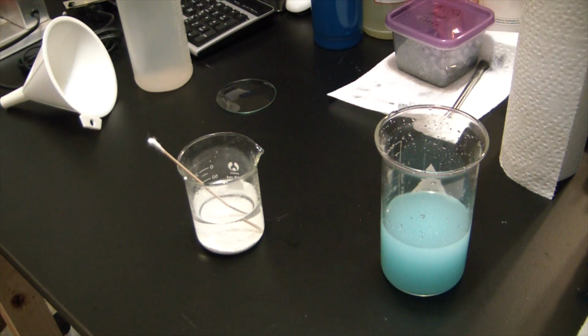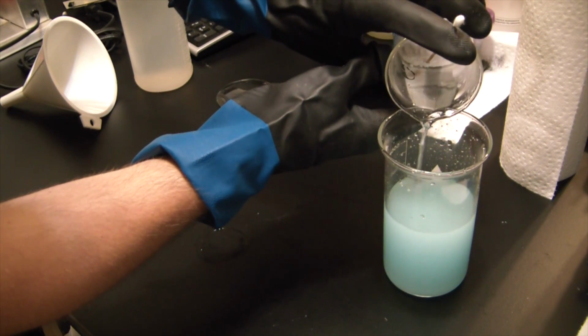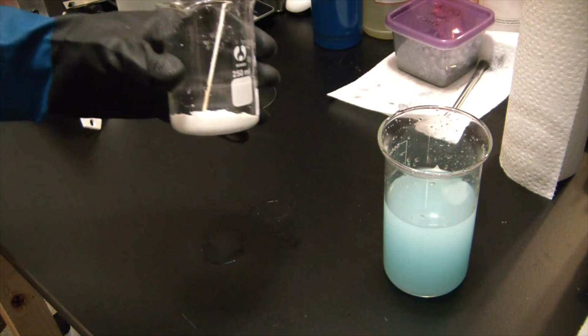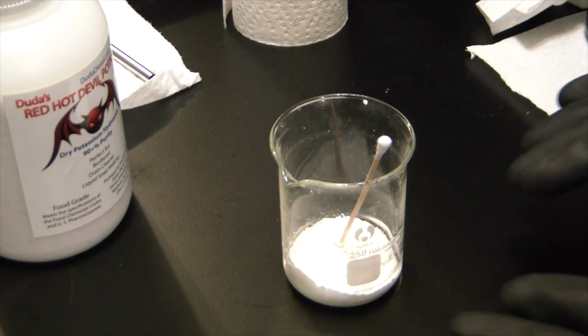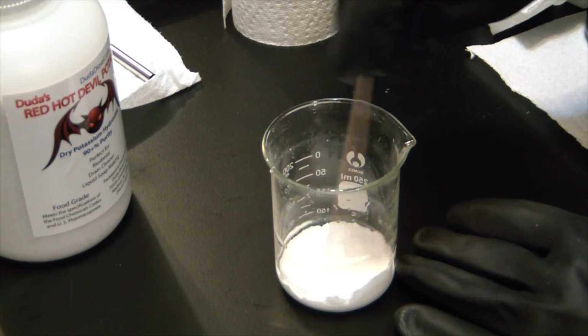Alright, let that silver settle out for a minute, and then I'll decant that off and run it through a filter. And what we have here should be some very, very pure silver chloride. So at this point we've got the silver chloride in a little bit of water.